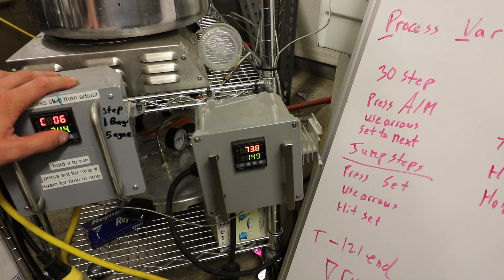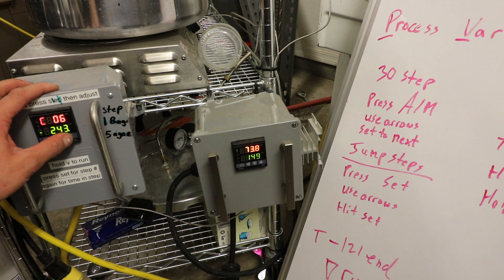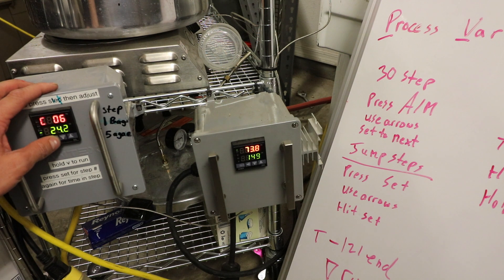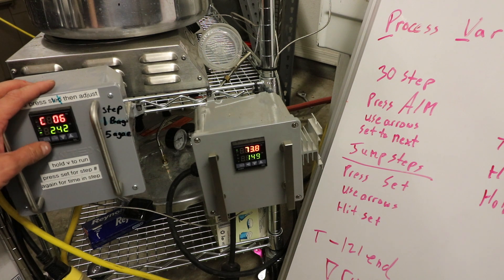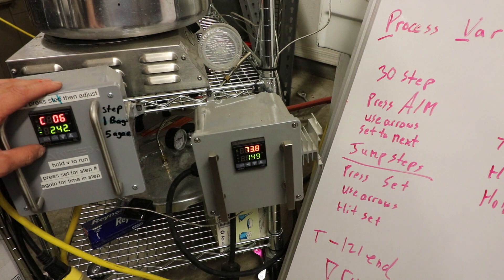Right now it's telling you that step six is 244 Fahrenheit. If I wanted to adjust that, I can go up and down, and I can also move the decimal point over and move it around like that. If I wanted to go to the next, I would just hit set.